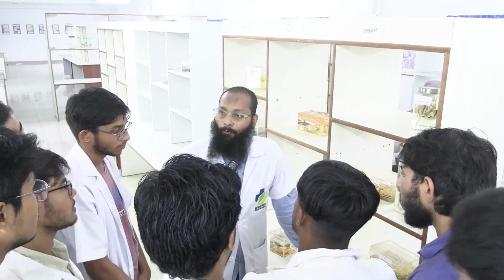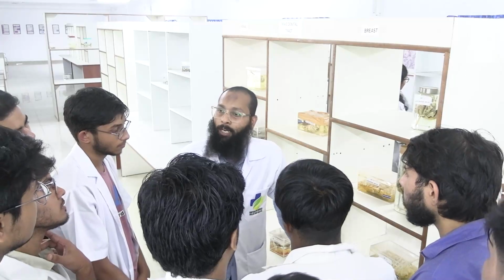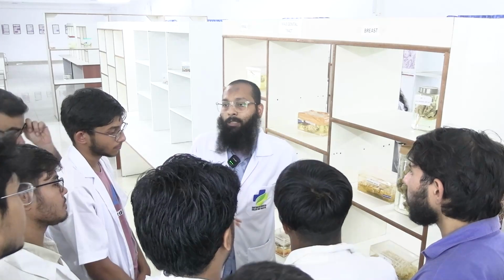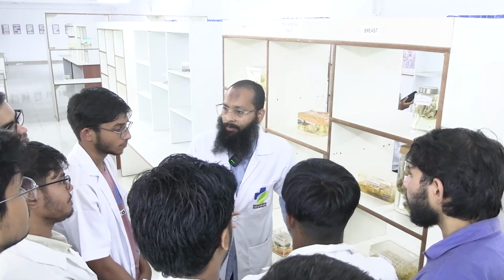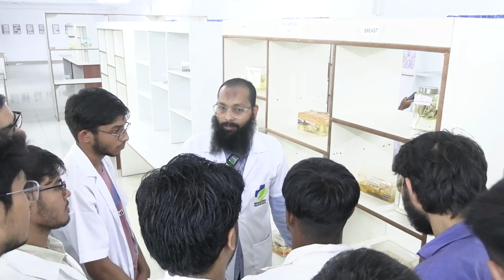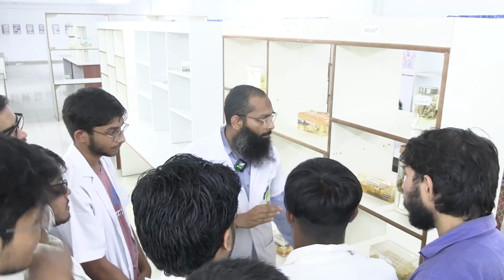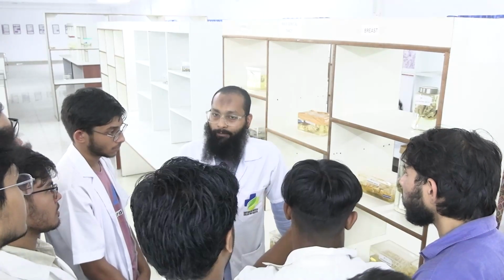Out of these 4, the first 2 cases are benign, the third one is pre-malignant, and the fourth one is malignant. Fine, so how can we differentiate? The mass will be well circumscribed in all these 3 cases: Phyllodes, Fibroadenoma and DCIS. But in case of carcinoma breast, it will be ill defined.